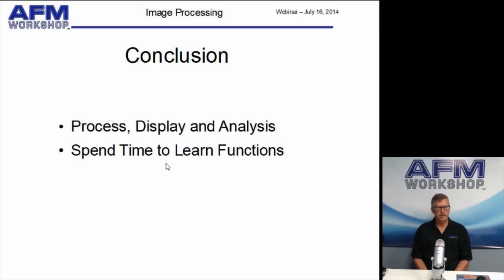If you want to do the more advanced functions, you might spend as much as a month to learn all of the details of the image processing to become an expert in this. And we really recommend, if you're going to use your AFM a lot, to invest the time to learn all the functions.